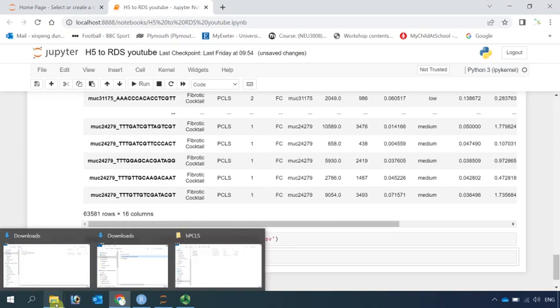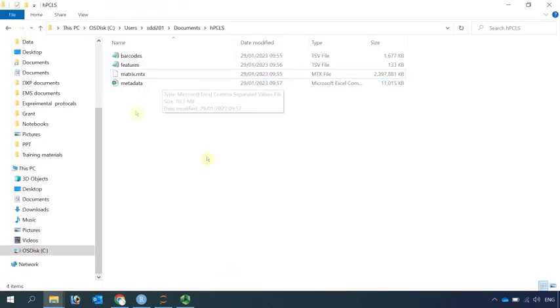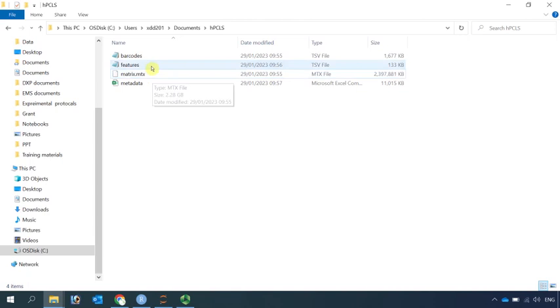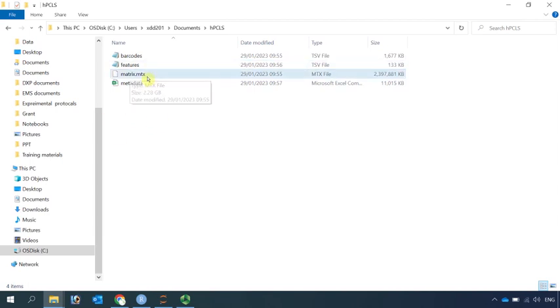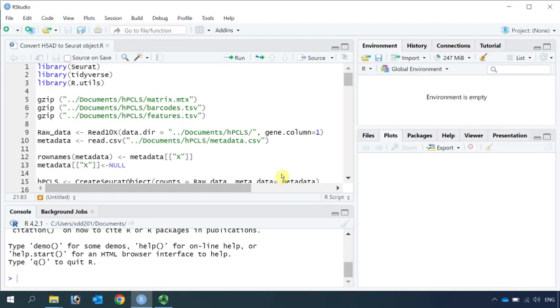Now if we go to our folder, you can see we have all the files: matrix, barcode, features, and the metadata. Then we can read those into R and perform Seurat analysis.